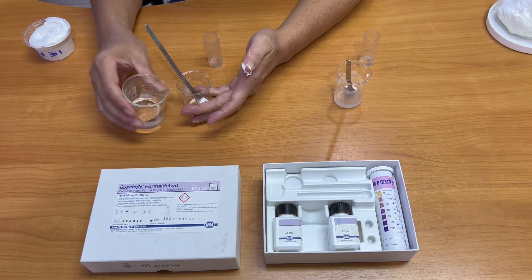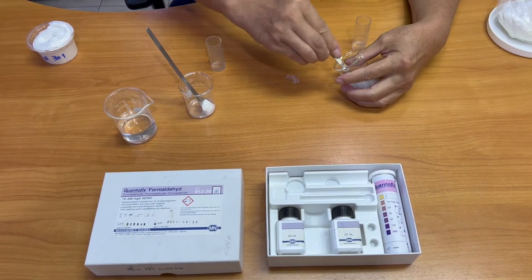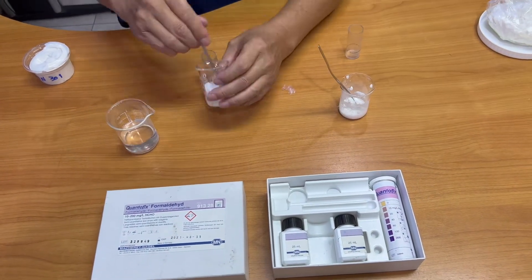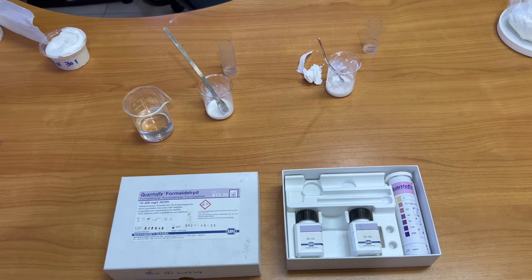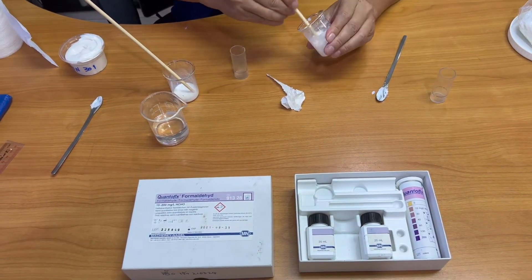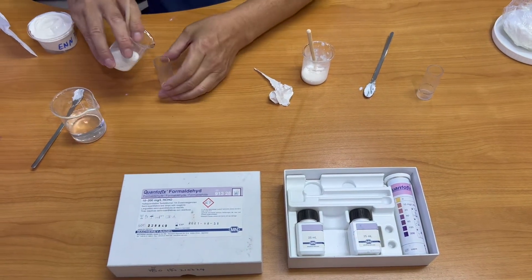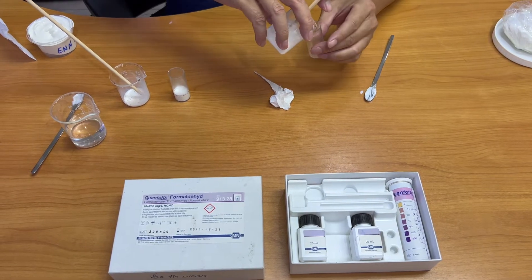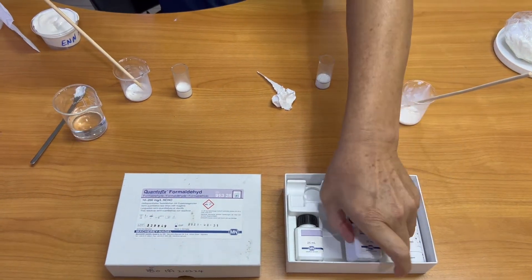We use water to dilute both products. We are going to use the chart as well to evaluate the products on the market and take care of the material. After we mix with water, we put them in a small tube.